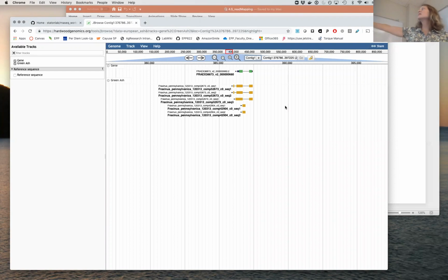So when you're building these online visualizations, this is a GFF file specifying where to draw these boxes. It says, hey, you're looking at contig 1. We have a gene. There's an untranslated region, there's an exon, there's an intron, there's another exon. The way the software knows how to draw these little boxes is because it's reading that GFF file. If we didn't have that file, it wouldn't know where to draw the little boxes.